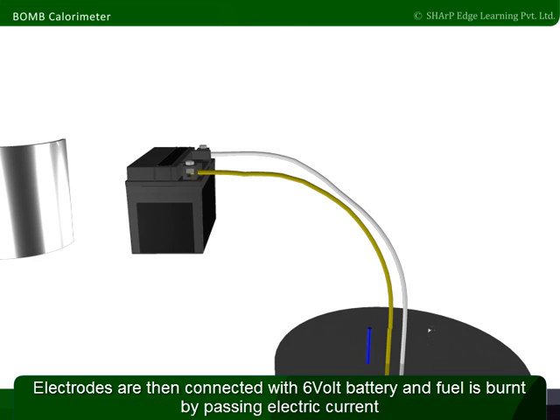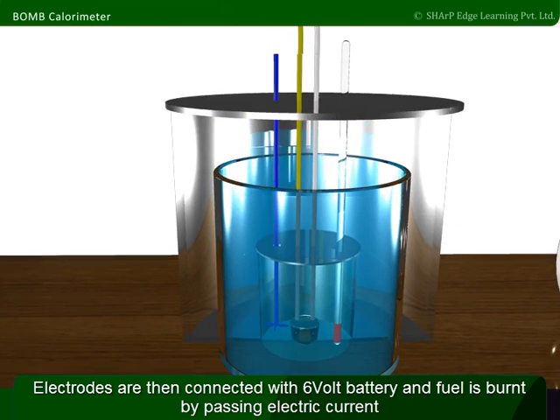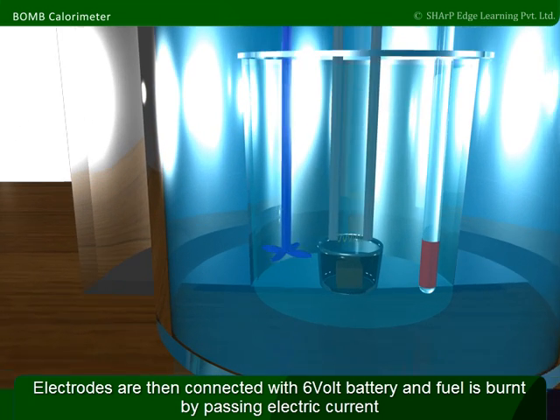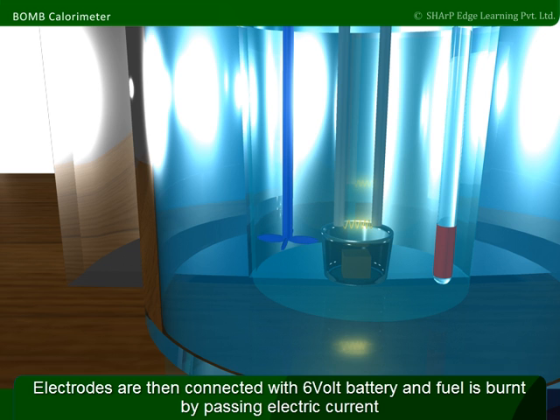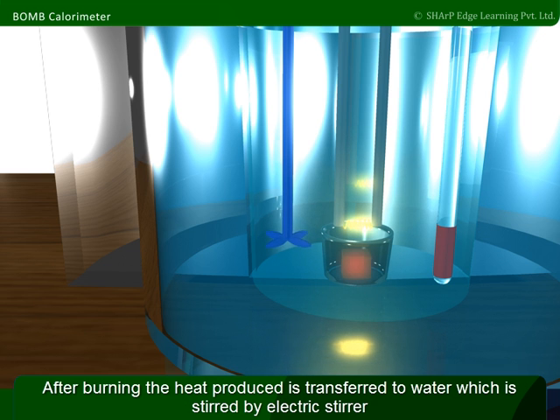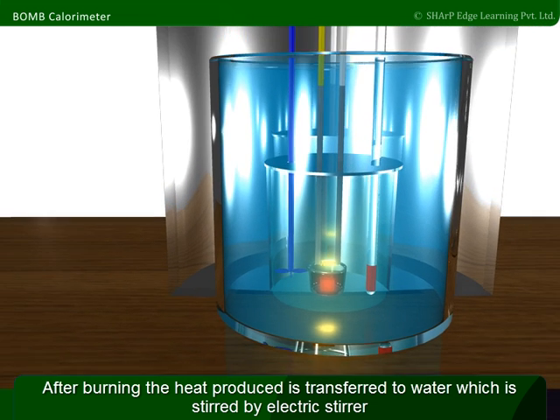Electrodes are then connected with a 6-volt battery and the fuel is burnt by passing electric current. After burning, the heat produced is transferred to water which is stirred by an electric stirrer.